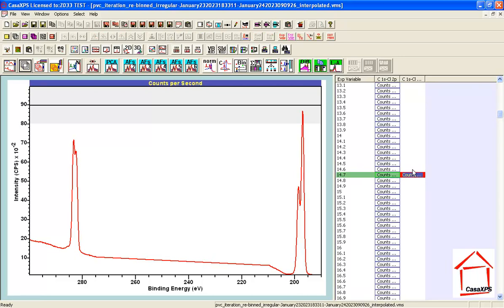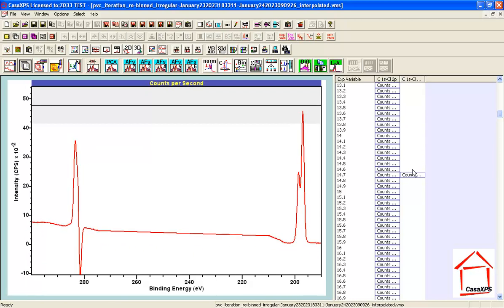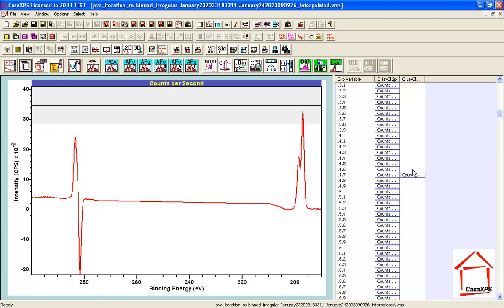This is helping me keep track of where I am in the calculation, and it is selected, so I can use the arrow keys and step back to the list, and then I can continue down the list looking for the opposing type of spectral shape that will be the opposite in the difference list, that will represent the alternative state within these data.